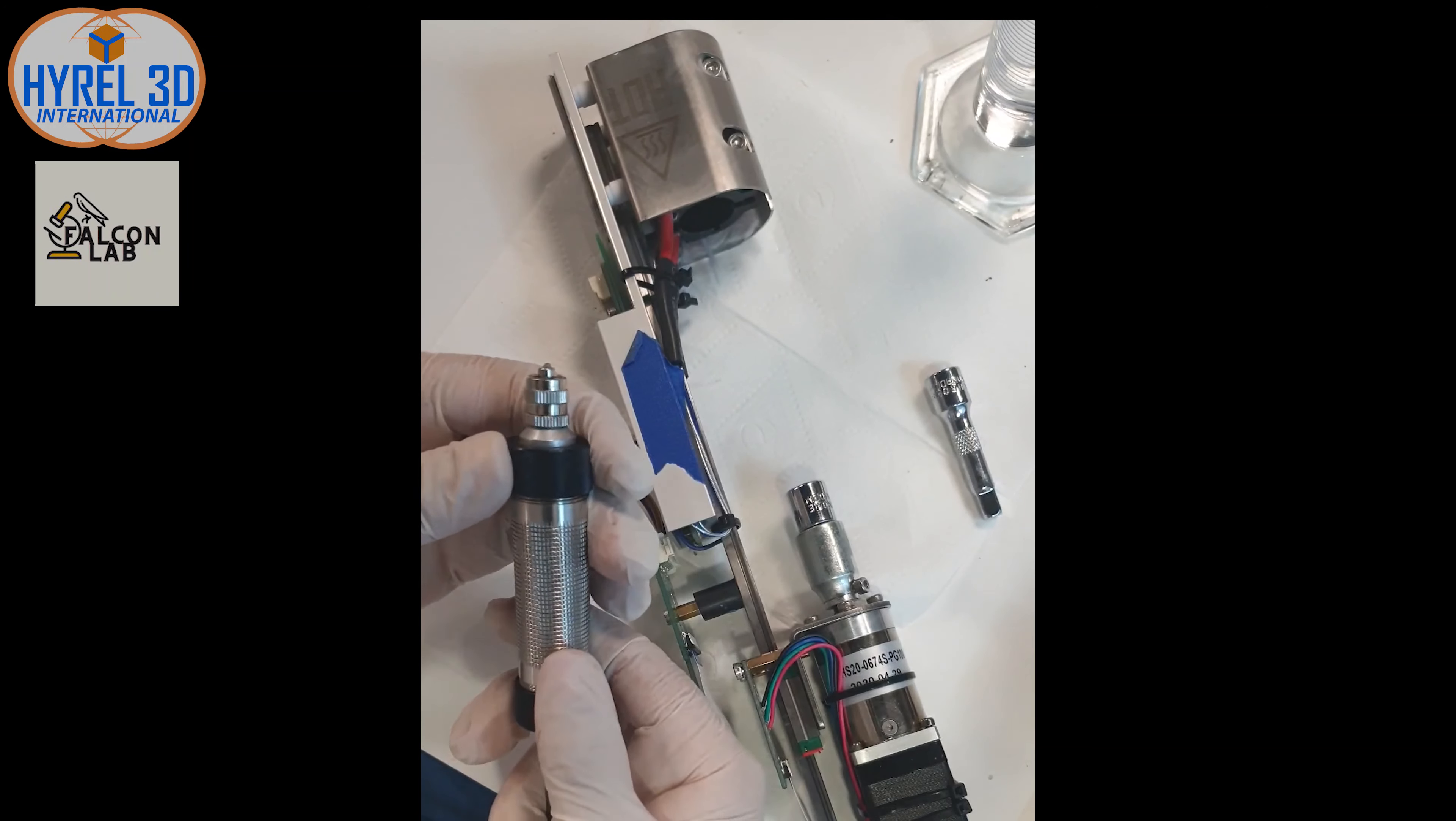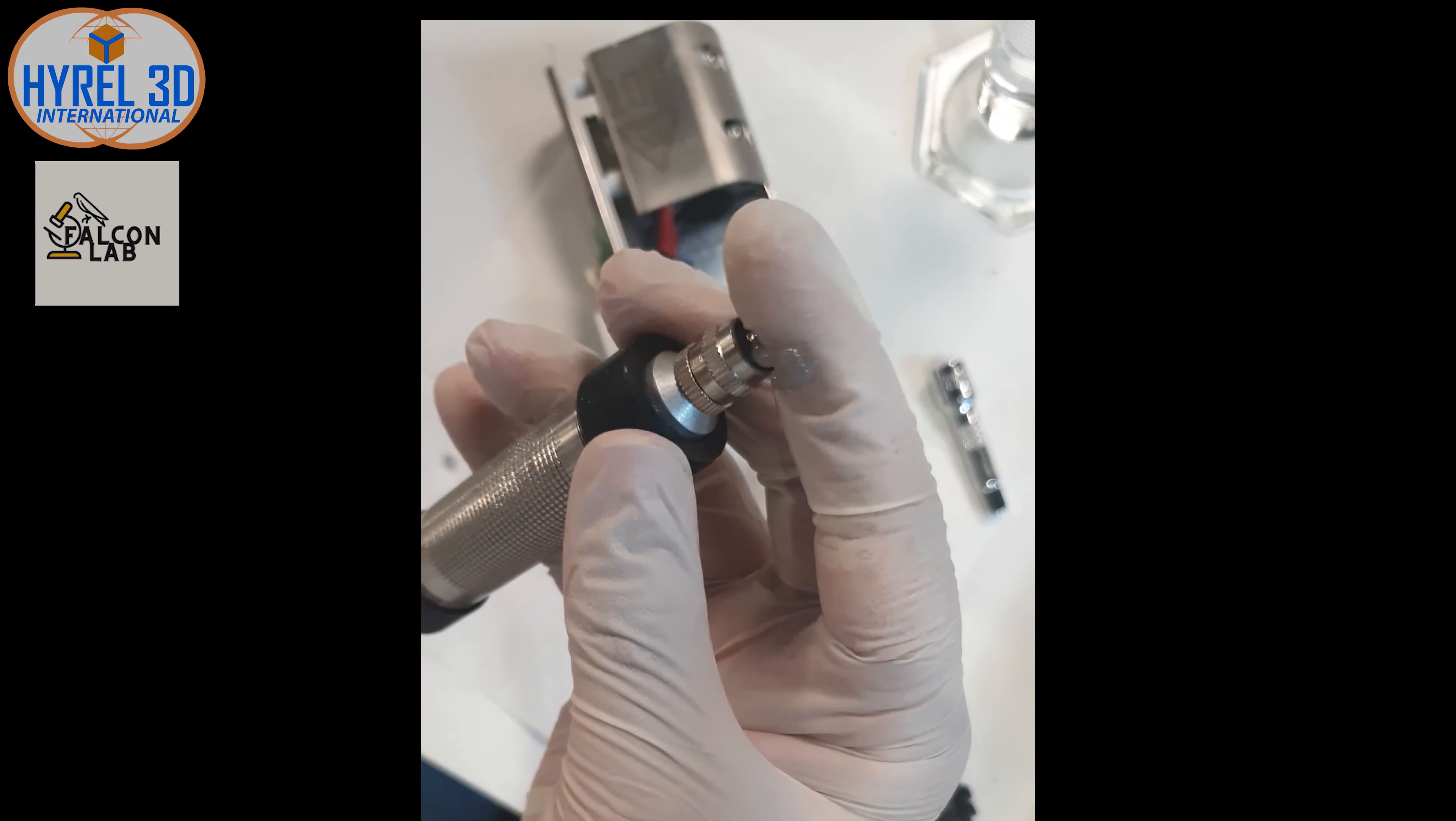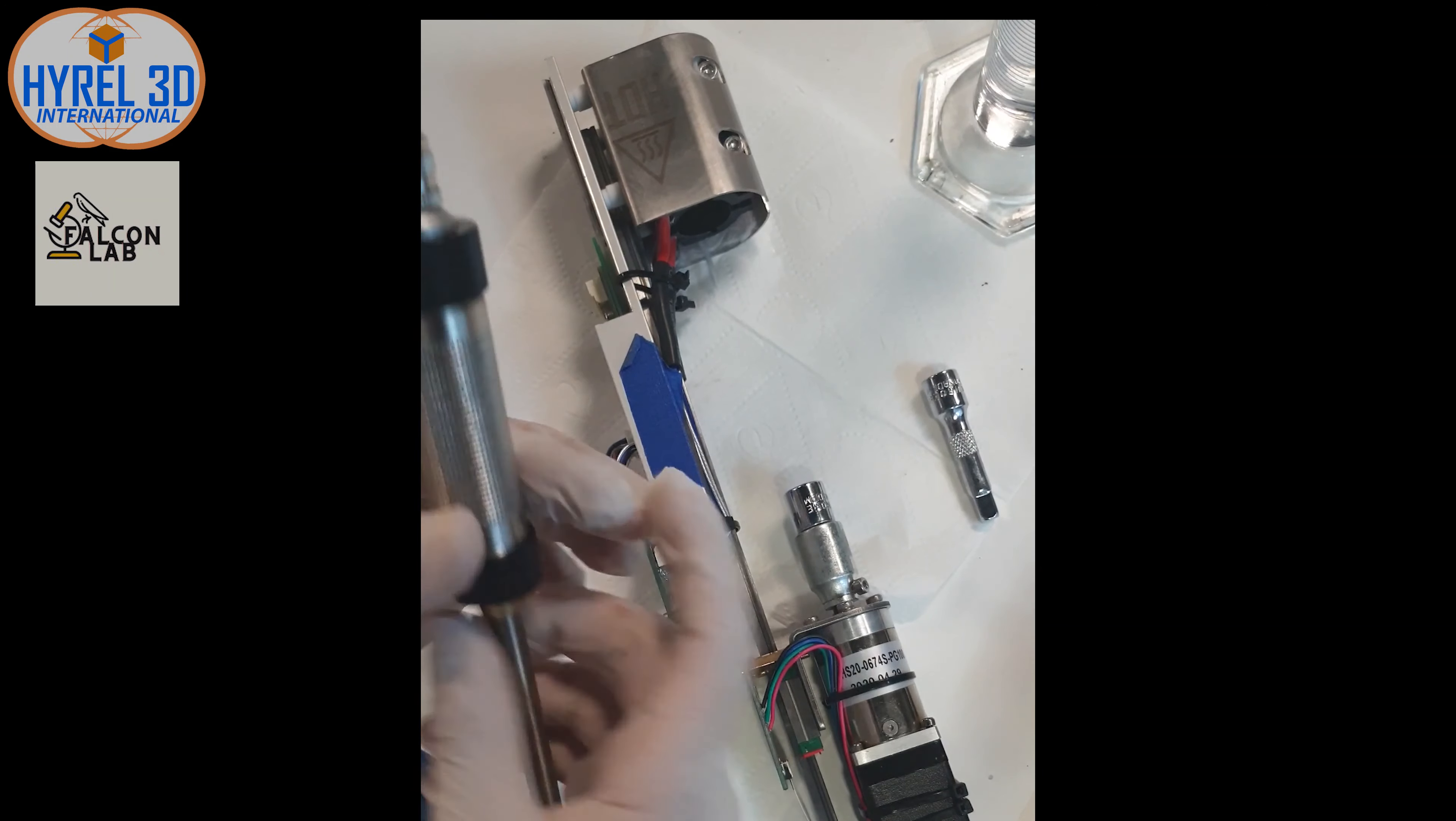After the time has passed, we will now load the cartridge to the printer. To make sure of the consistency of the mixture, you can push it out and check it.